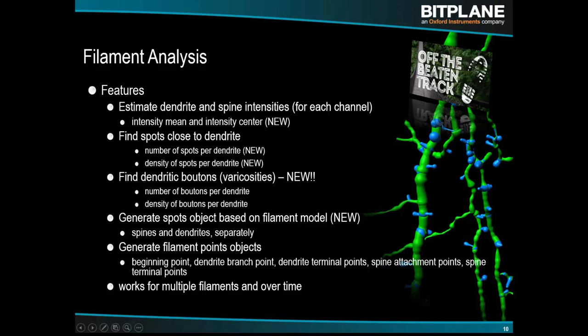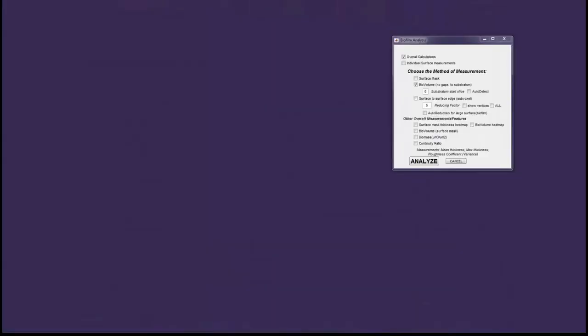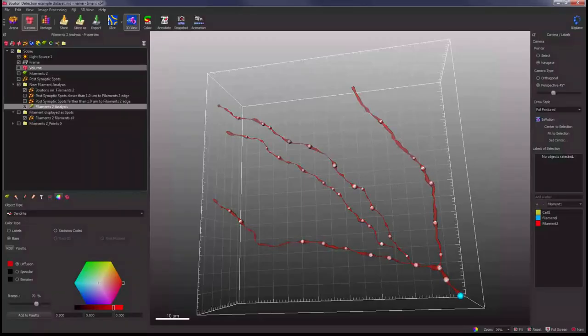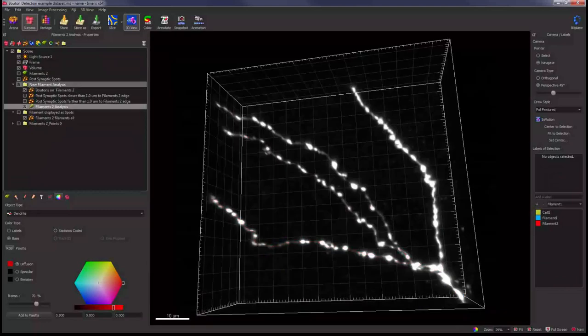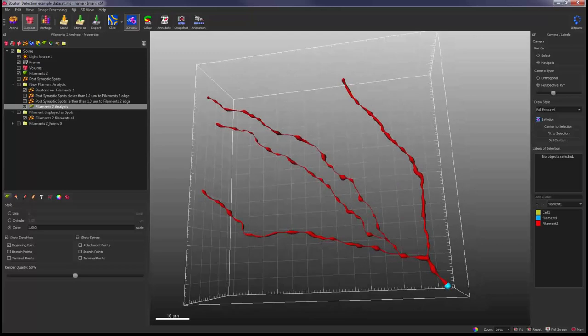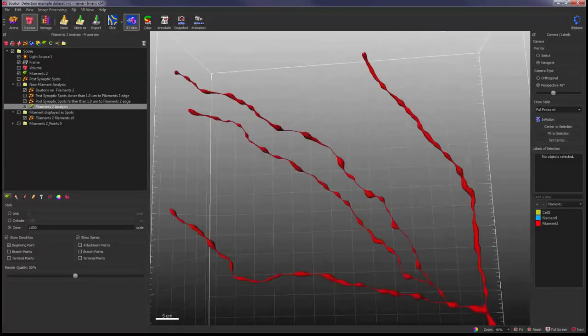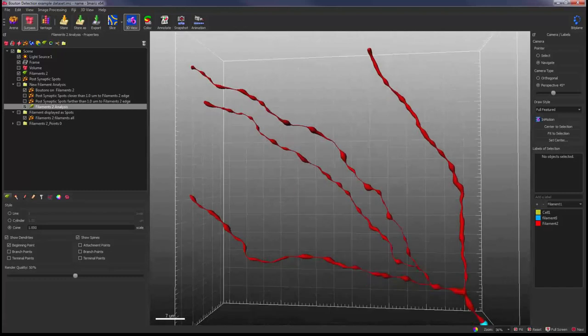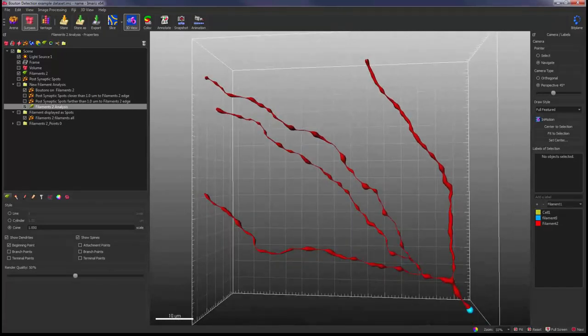Let me show the filament dataset. Starting with bouton detection — you have a filament that looks like this in the raw data: a dendrite with a couple of branches. After tracing in Imaris, you get this elegant rendering that Imaris produces really beautifully — it looks like a real neuron, a very nice rendering of the traced filament object.